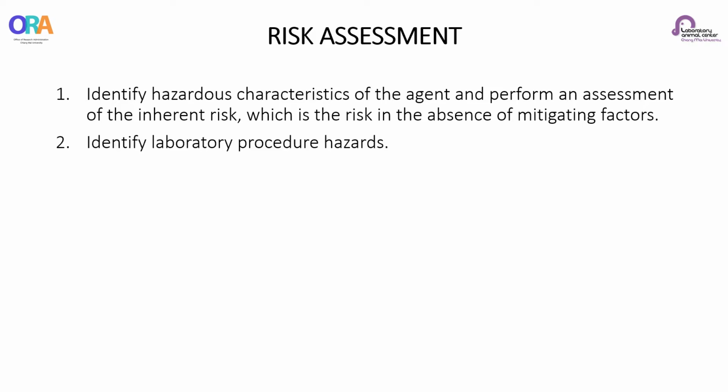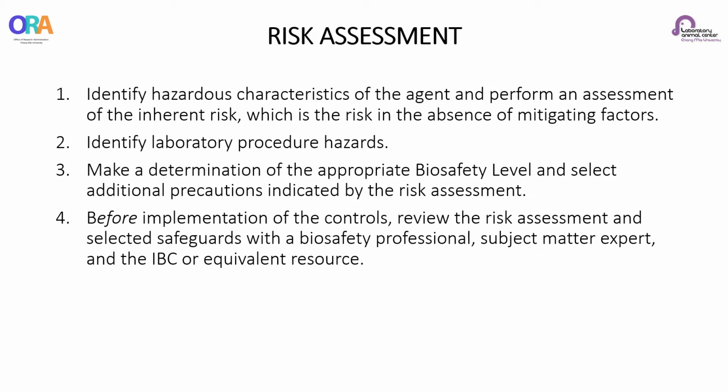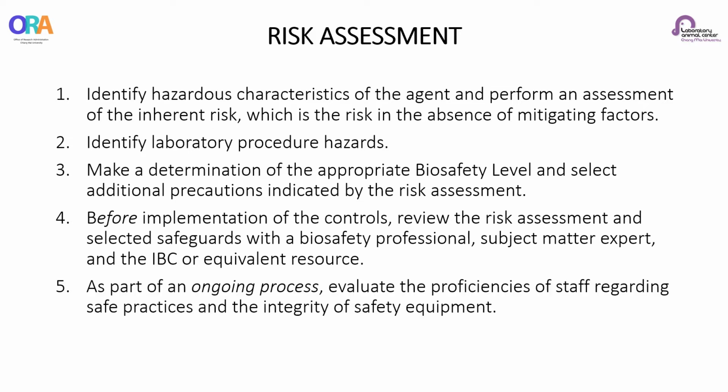Two, identify the laboratory procedure hazards. Three, make a determination of the appropriate biosafety level and select additional precautions indicated by the risk assessment. Four, before implementation of controls, review the risk assessment and selected safeguards with a biosafety professional, subject matter expert, or the IBC or equivalent resource.